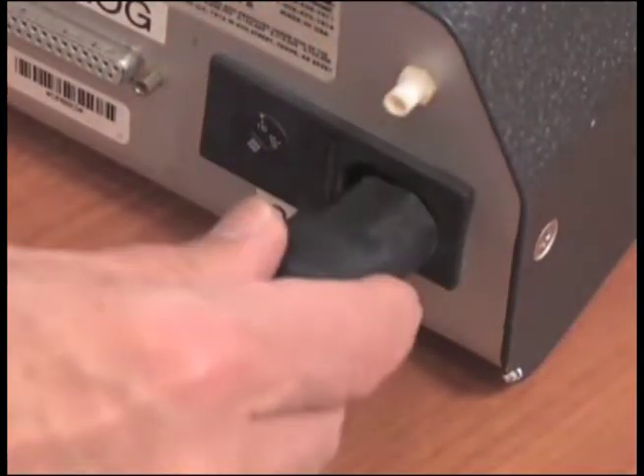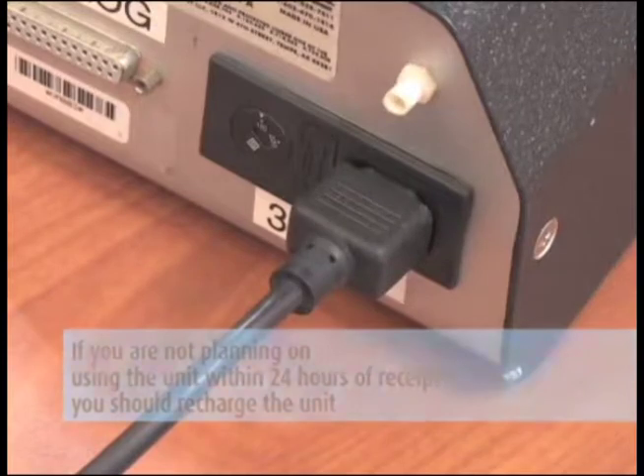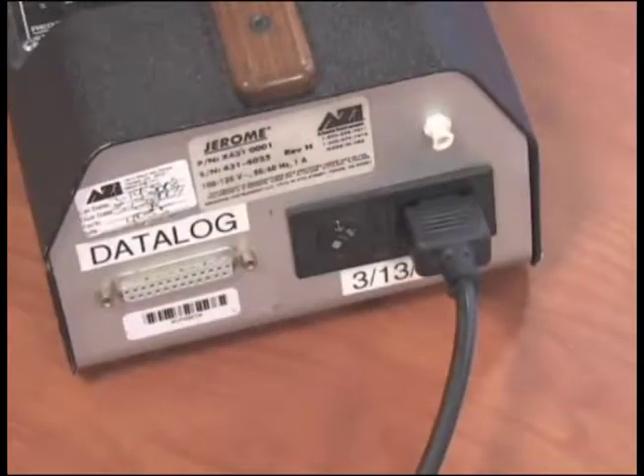If you are not planning to use the unit within 24 hours of receipt, you should recharge the unit by attaching the charger to the unit and to an AC outlet. Let it charge overnight.